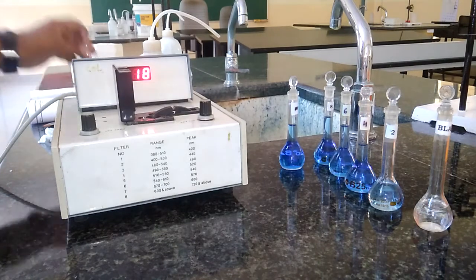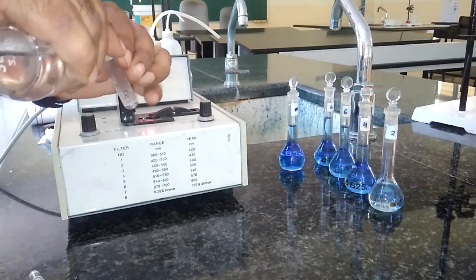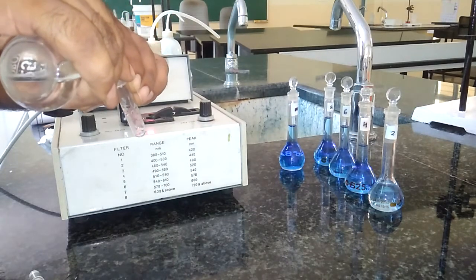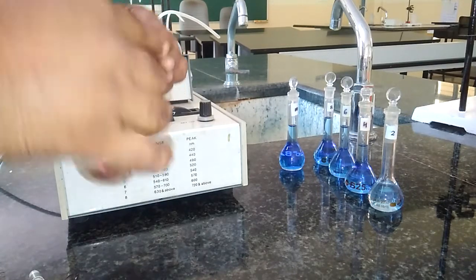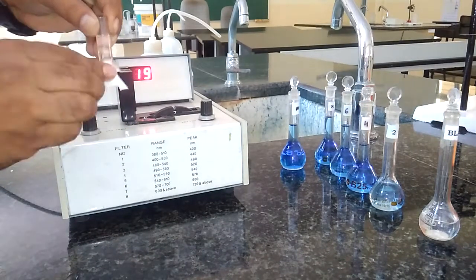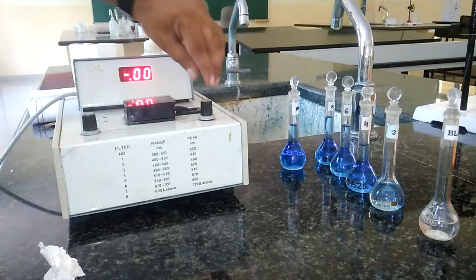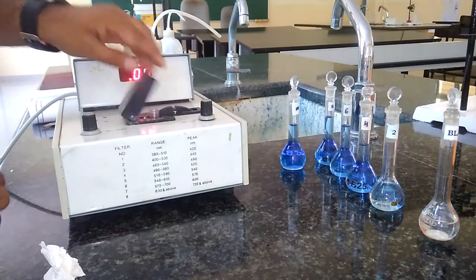The first thing is to set the absorbance to 0 by using the blank solution. I am taking the blank solution in this cuvette. We have to rinse the cuvette with the same blank solution, and then after rinsing, we add three-fourths of it. We have to wipe the cuvette well using tissue paper before inserting it in the colorimeter. We select 0 here — yes, it is showing 0 now.